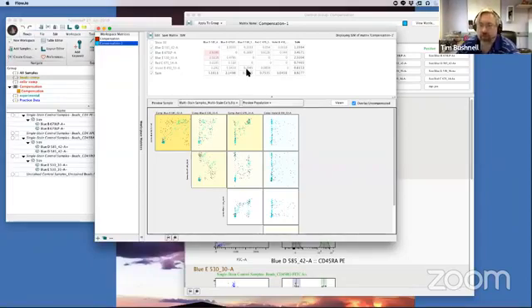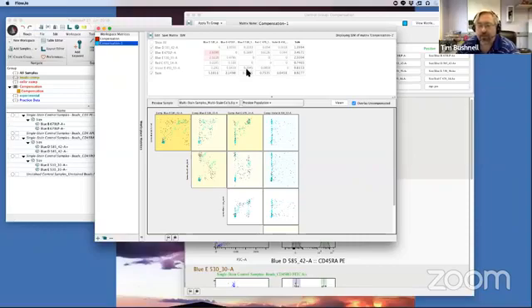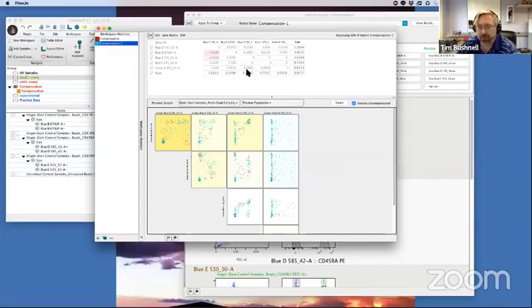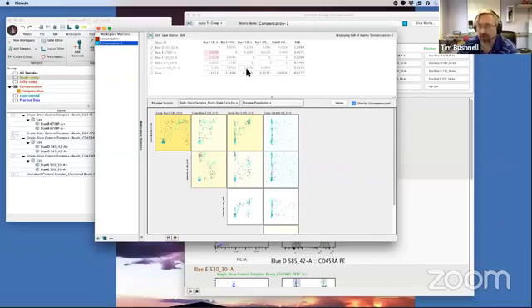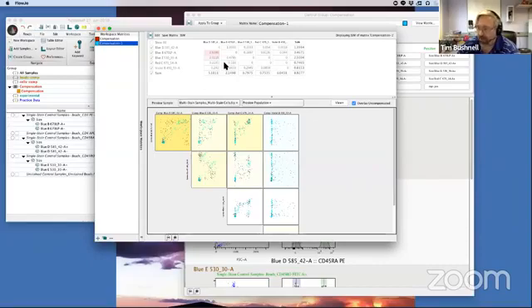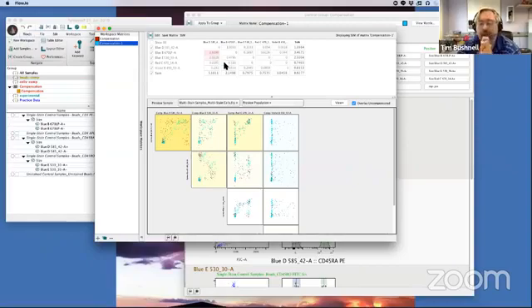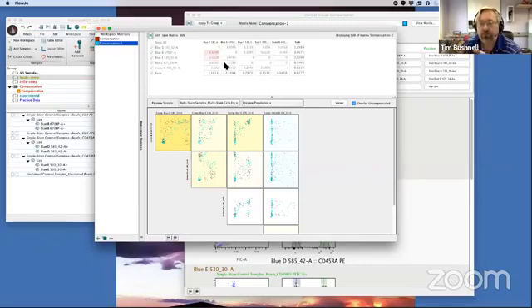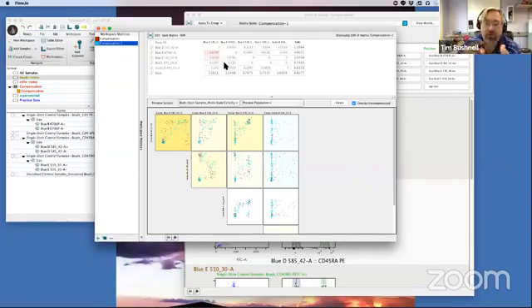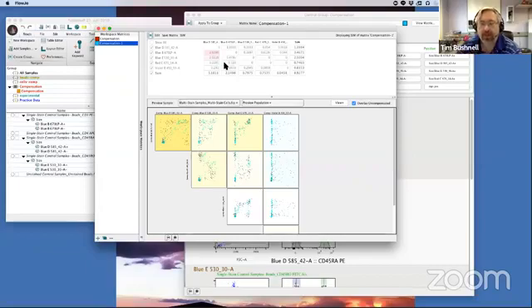In an upcoming video, we'll be actually showing you how to use this in conjugation with the new BD CD4 multi-panel set, which allows you to provide 24 different fluorochromes labeled to CD4. They both have a human and a mouse panel. And this is useful because you can do this calculating the staining index. And you can also use this to calculate the SSM. So with that, the SSM and the compensation matrices can be saved. If you use the SSM, you can also use it as a tracking tool to help understand how things are going over time, how your system is behaving, how the instrument is behaving. But also very useful for knowing where and what instrument you might want to use for designing your experiment. And that's where that 24-color kit comes into play. And we'll talk about that in the very near future.